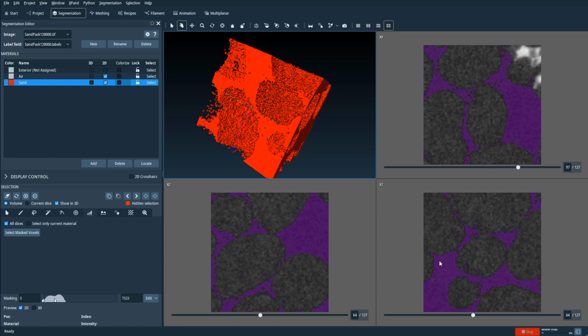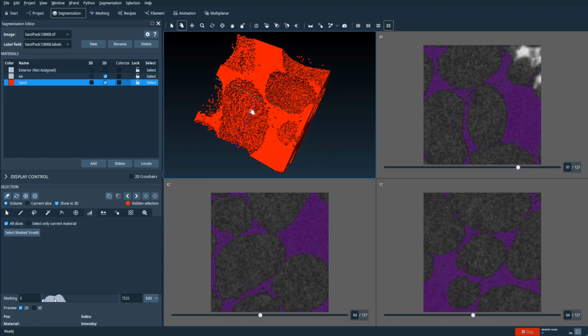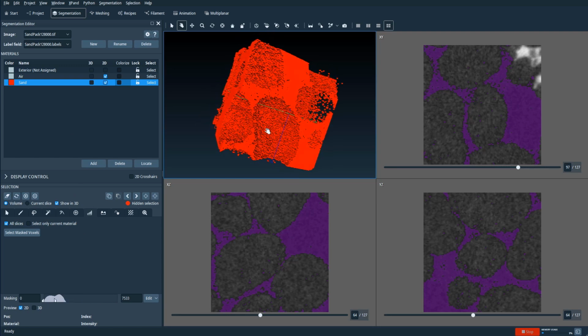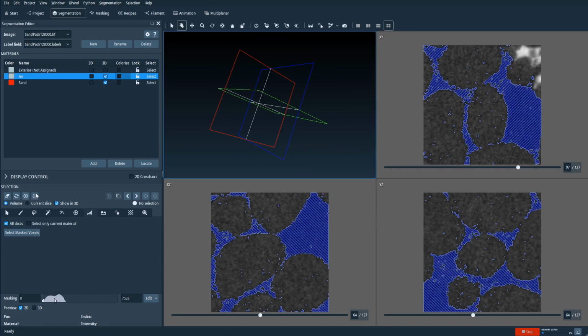And that's because of the noise in our data set. And in just a few moments, we're going to try to deal with this using pre-processing. Okay, so before we do that, I want to first add this preliminary selection to air. Okay, let's add that.